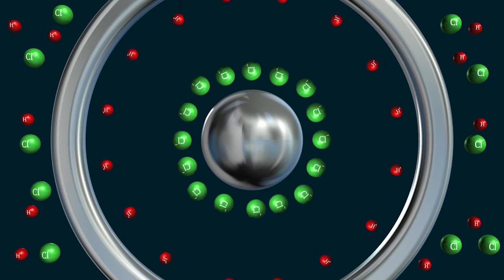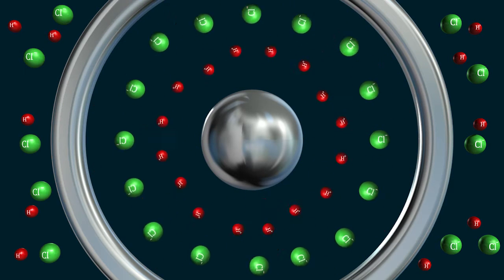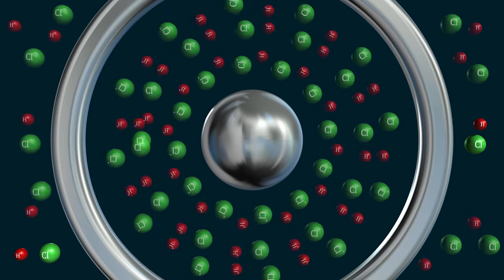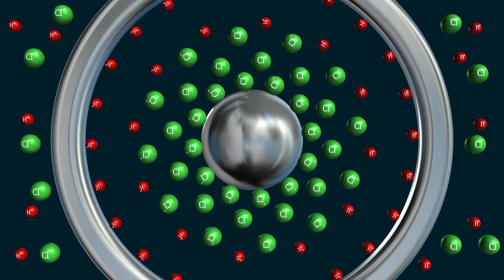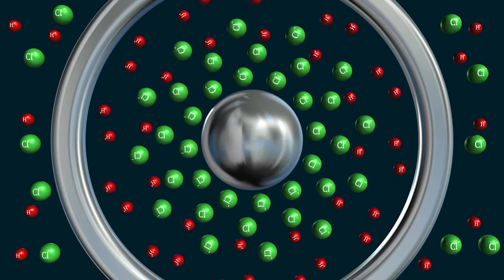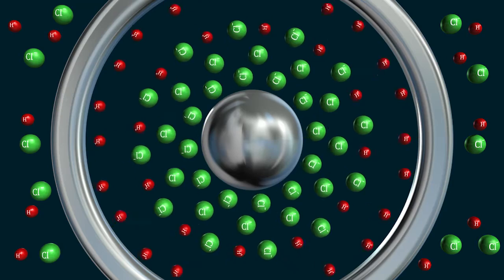A 10% acid, for example, is a very good conductor because it contains many ions that transport the charge. In contrast to this, pure and ultra-pure water are bad conductors because they contain only few ions. If, however, the ion concentration becomes too high, the Coulomb force increases. This electrostatic force leads to a mutual repulsion of the ions and thus a reduction of the current. The effect is called polarization and occurs with highly concentrated media.